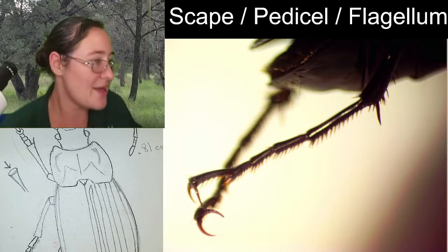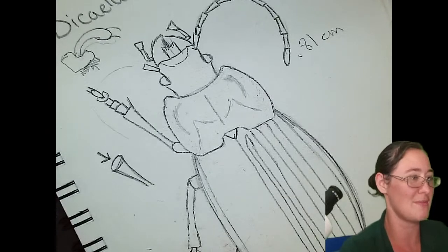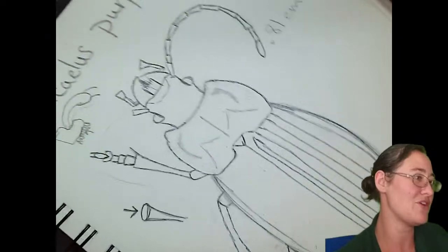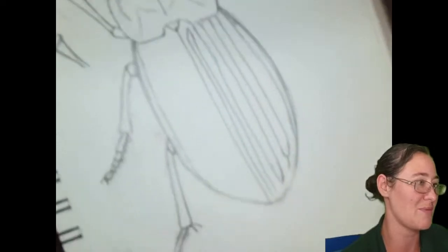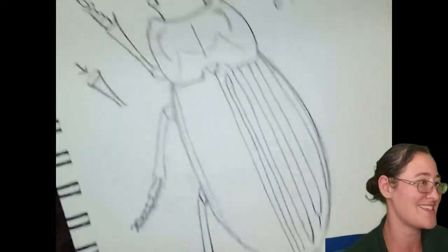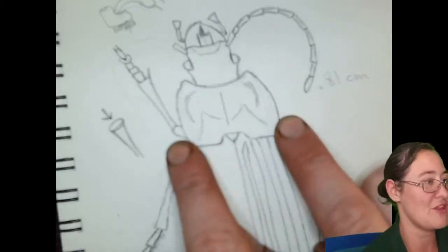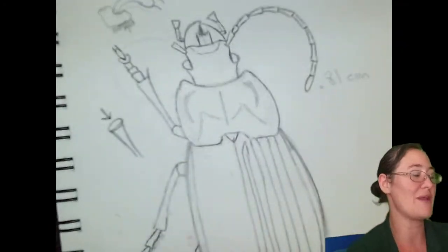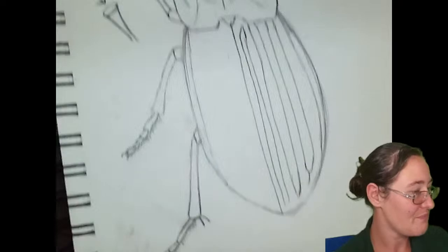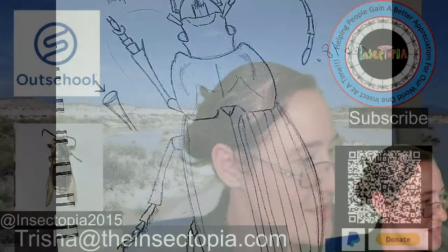Okay. Let's see. I even have this page if you want to see my... Oops. Microscope's in the way. There we go. This is what my beetle looks like in its entirety. I did kind of add a tarsal segment or two in there, but there is my sketch. I think that if I was going to change it, I might make the beetle even wider to give it space. But I'm pretty happy with it for sure. And let's see. There it is.